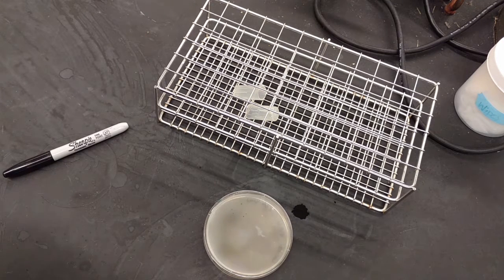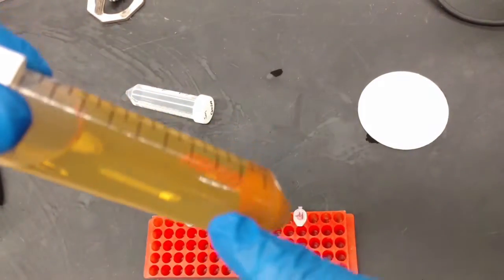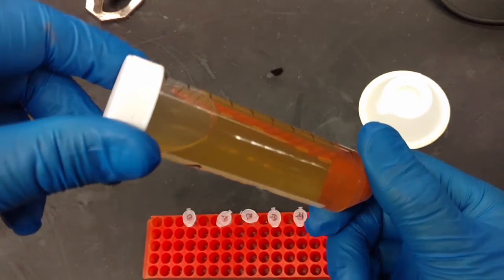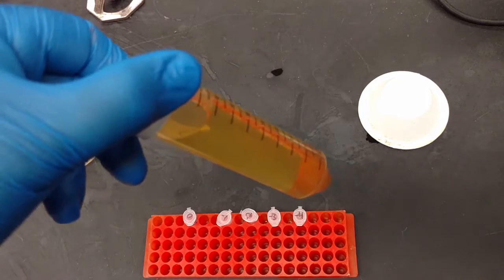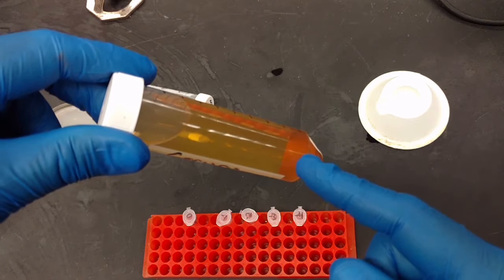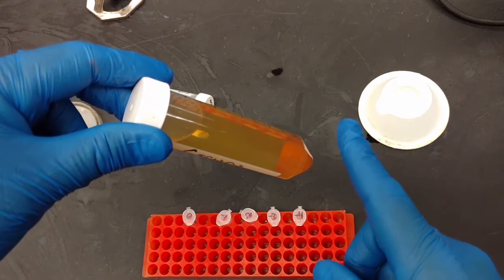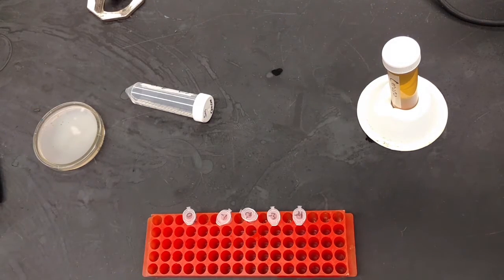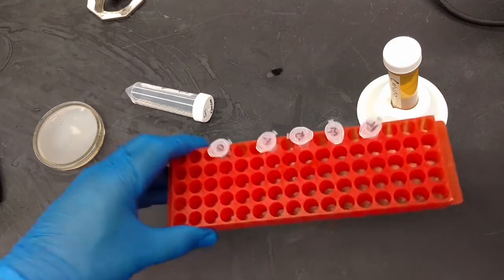We just took the enrichment out of the centrifuge and you can see the soil and bacteria have all been pushed to the bottom — we have a supernatant with bacteria and phage floating in it. We want to get the phage out. The lab manual says to dump it into a new 50 mil conical, but you only need to do that if the pellet is super loose and you have to centrifuge it again. If the pellet is nice and tight like this, you're going to filter it.